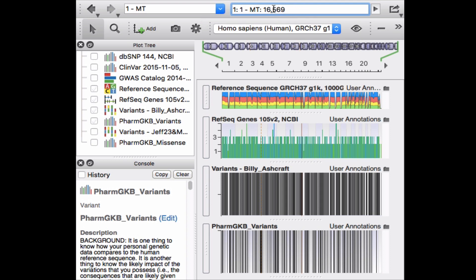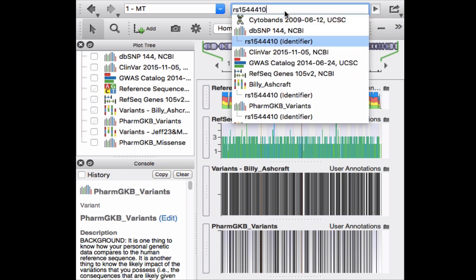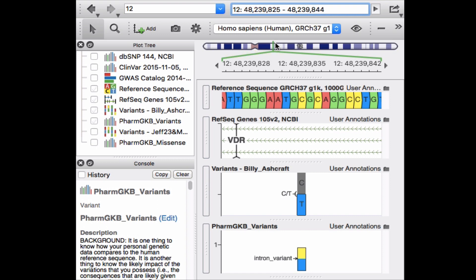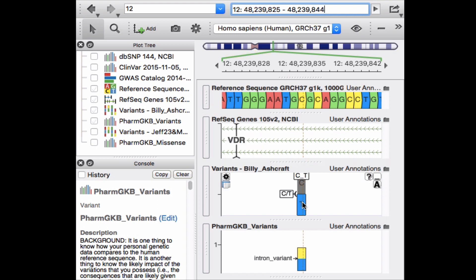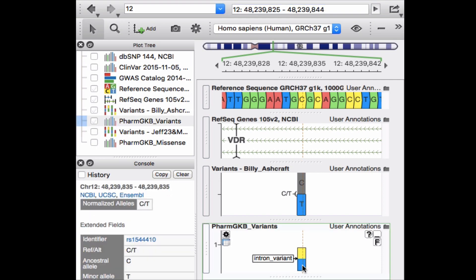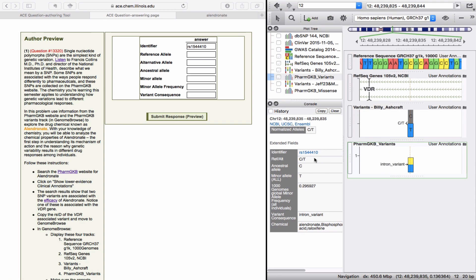Paste the RSID from PharmGKB into the feature and genomic coordinate search bar. Click on the correct identifier that appears among the options. Then click on the variant that appears in the PharmGKB Variants track. Use the information in the console window to complete the information requested in the table.